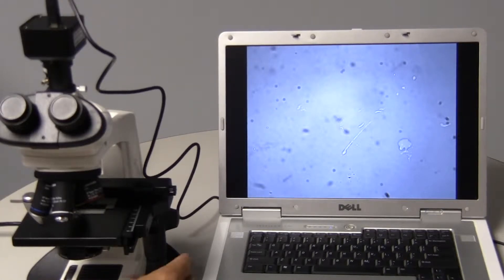One, of course, is on the specimen, and if it's on the specimen, it's easy to identify because when you move the specimen horizontally or vertically, whichever the case may be, the dirt moves with the specimen on the slide. So I'm going to move the slide out of the way so it's not a factor.